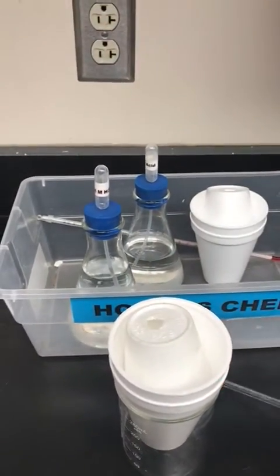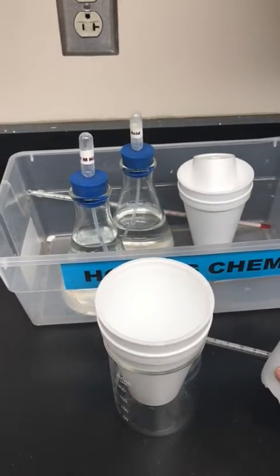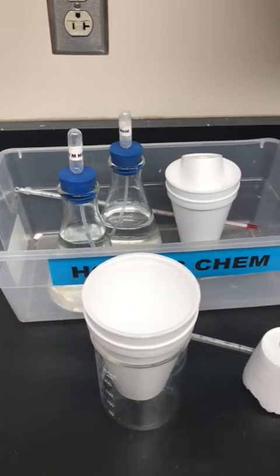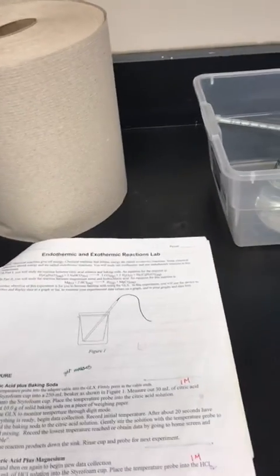When you are done, solutions can go down the sink with lots of water running, and then you're going to exchange data with the other group of 2 that is in front of you, and you're going to do a formal lab report. For the formal lab report, it does tell you that you do not need to do questions 4A and B and questions 5A and B. We will talk about those later.